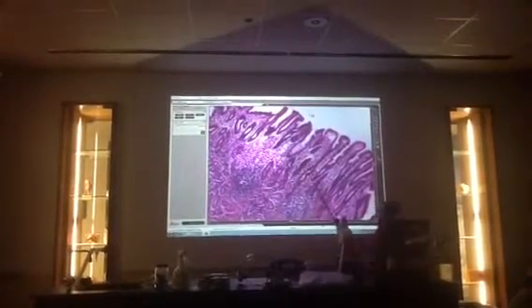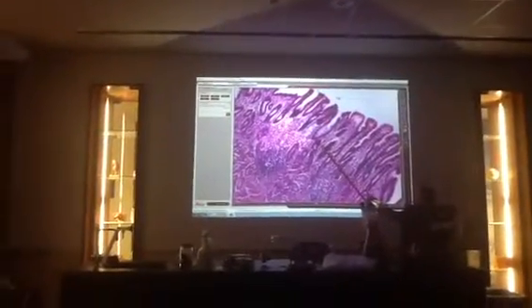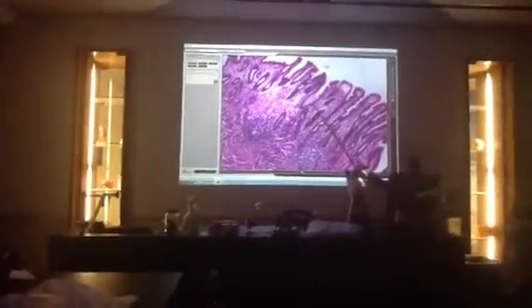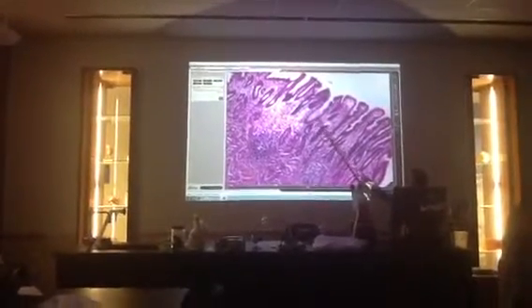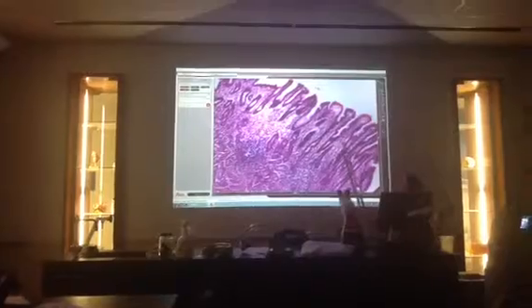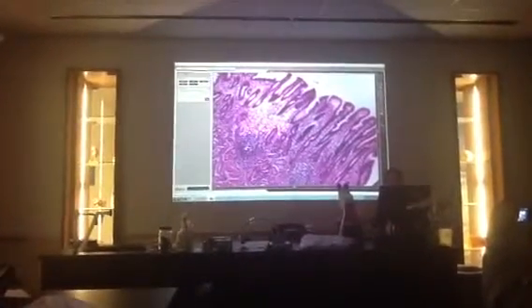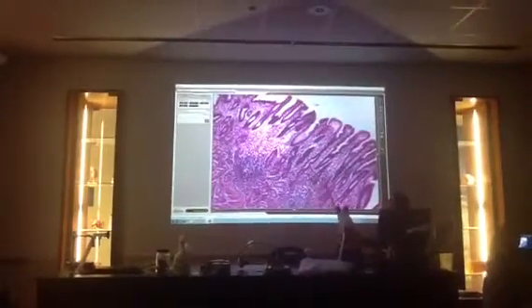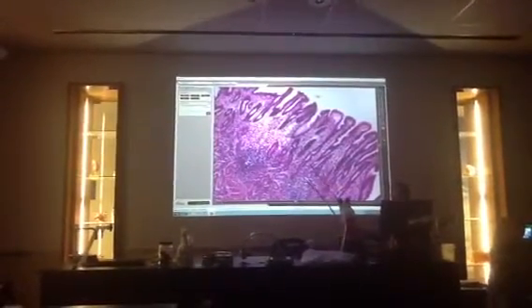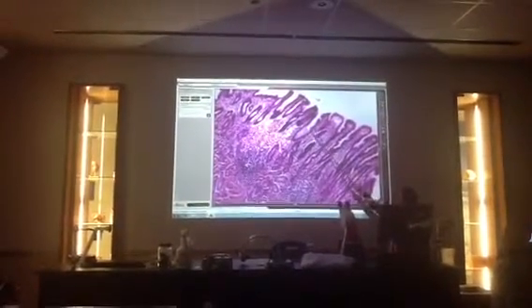Okay, on the simple columnar, what seems to happen is that the nuclei line up toward the edge, and then the columns stick out this way. And again, it probably looks better on your scope. My screen up here looks a lot better than this does. But the simple columnar is just going to line those areas here. So all of this is simple columnar.